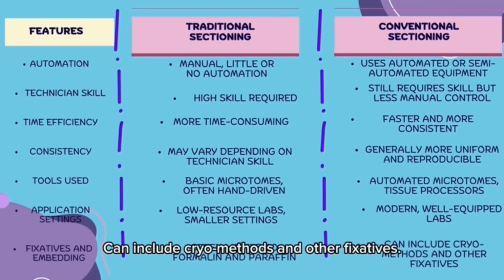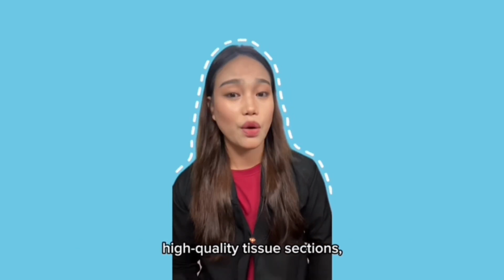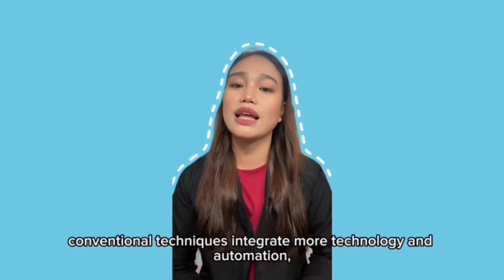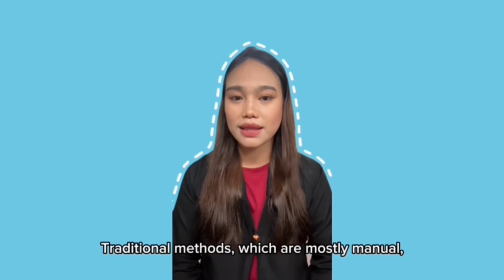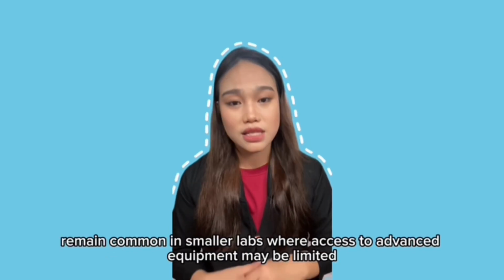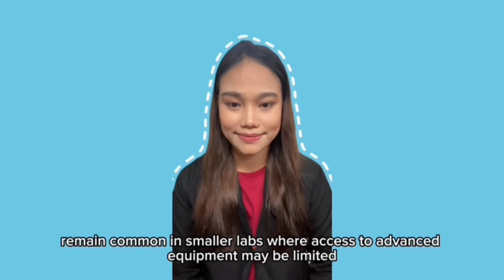and other fixatives. Although both traditional and conventional sectioning methods strive to produce high-quality tissue sections, conventional techniques integrate more technology and automation, enhancing efficiency, consistency, and throughput. Traditional methods, which are mostly manual, remain common in smaller labs, where access to advanced equipment may be limited.